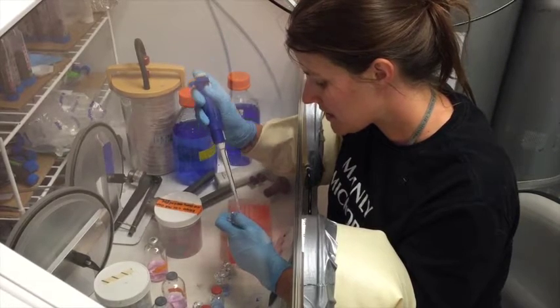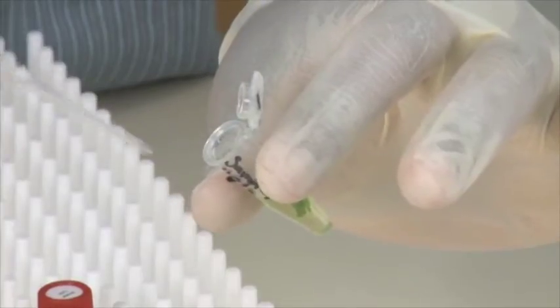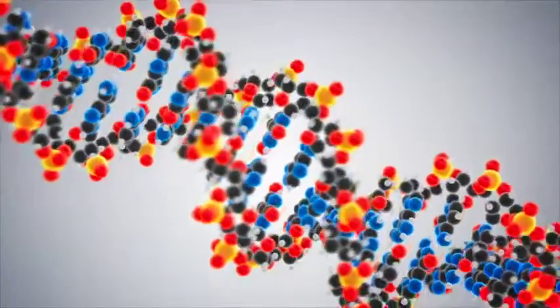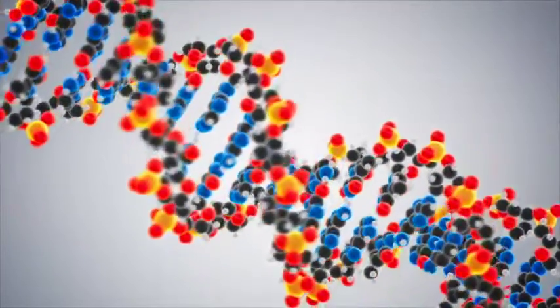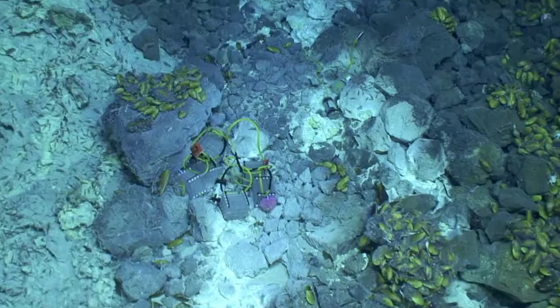Once the scientists have enough microbes, they can extract, or take out, only the microbes' DNA, which is the individual instructions inside every cell for how it lives. The DNA helps the scientists figure out who was there and how they might make a living way down inside the seafloor.